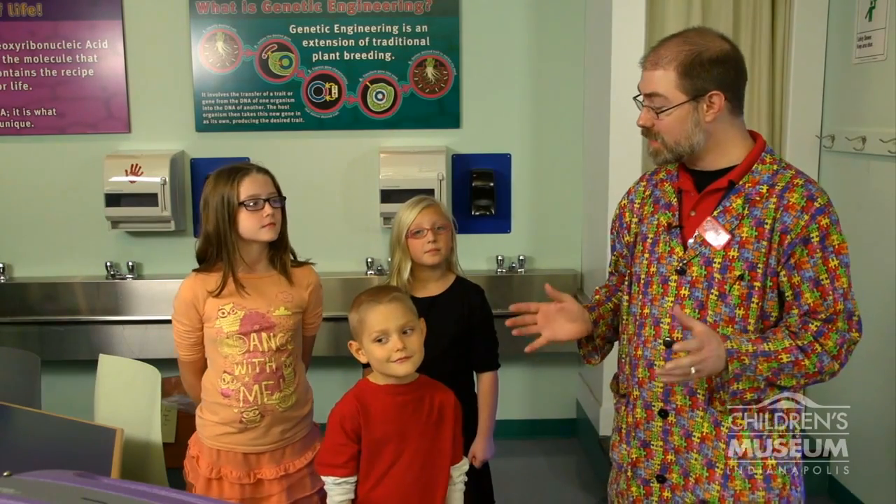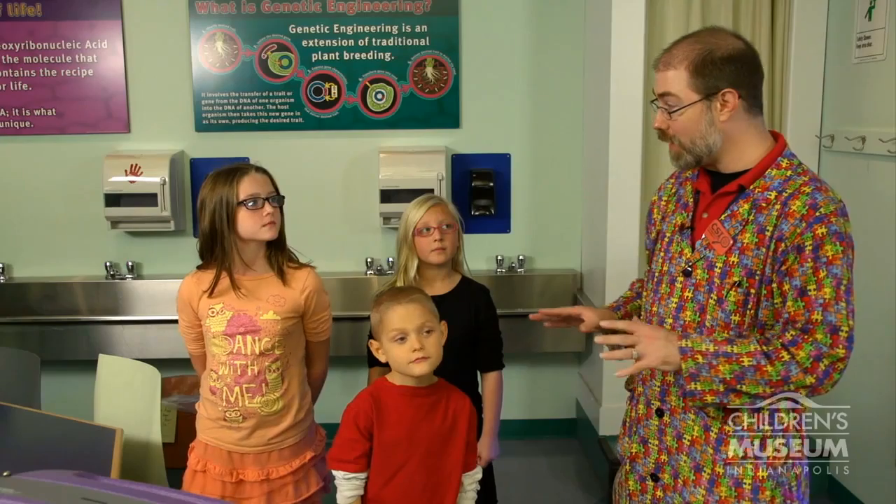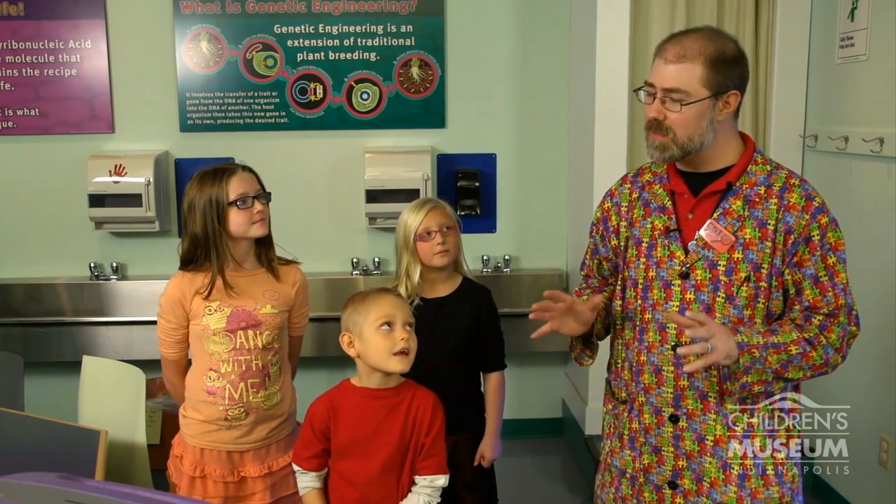Welcome everyone. We are in the biotechnology learning center and today we're going to be looking at how we wash our hands. Hopefully you've all had some experience with that. We're going to do something a little different today — we're going to see how well we wash our hands using a special lotion, something that nurses sometimes train with when they're working in hospitals.